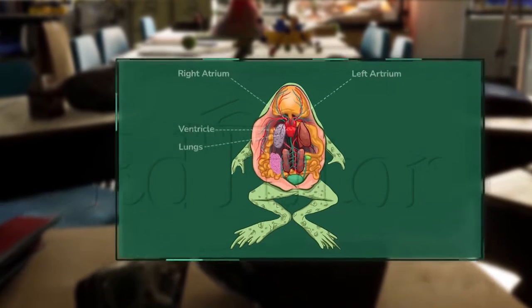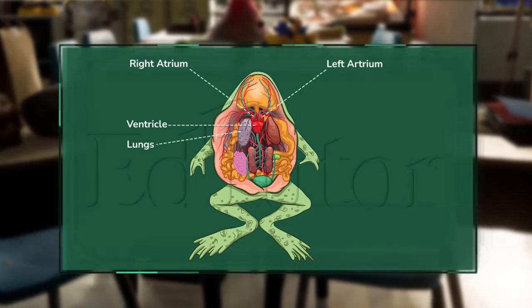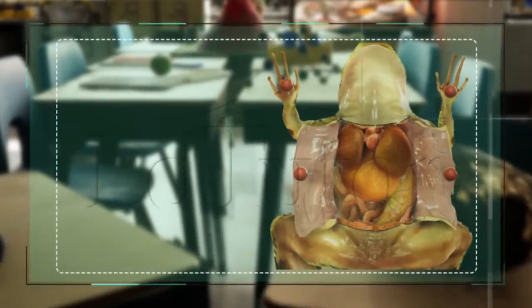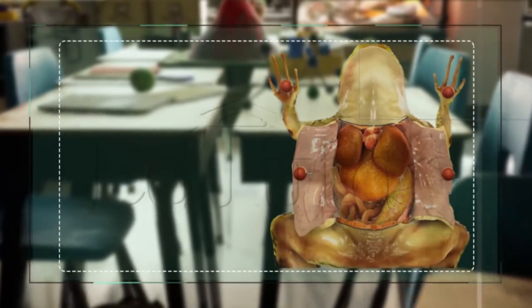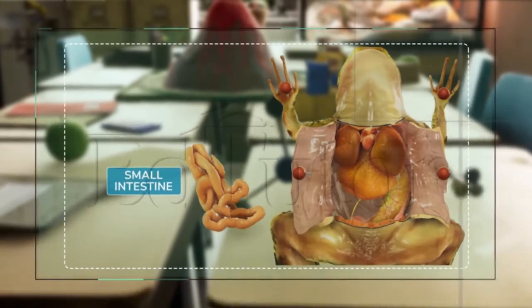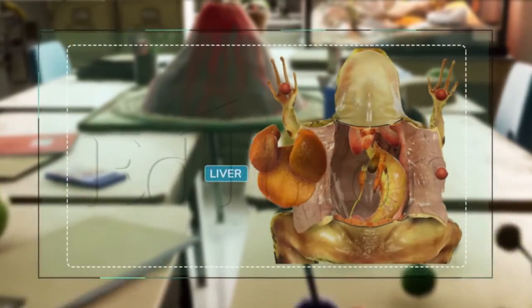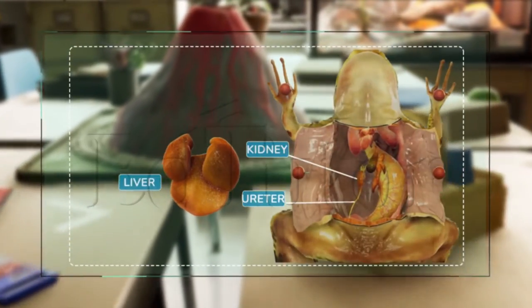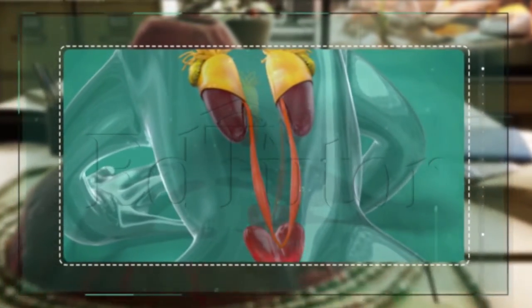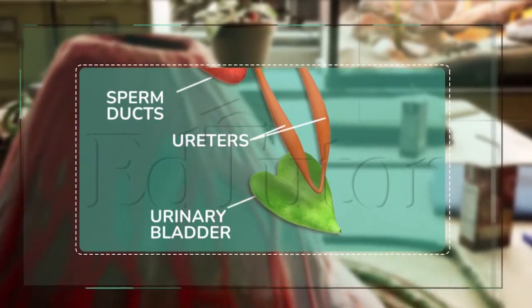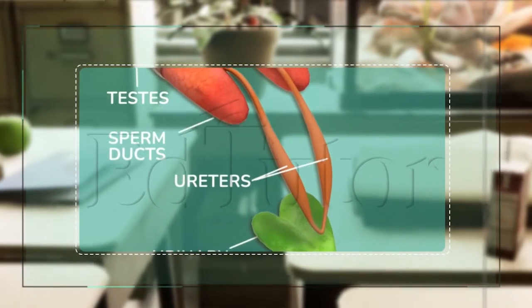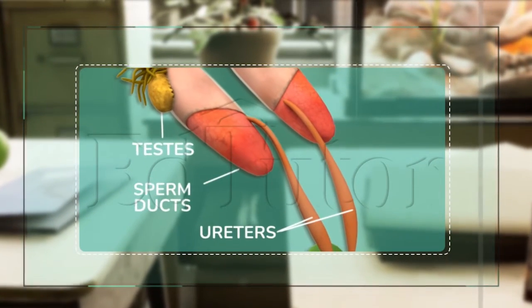As you can see, these are the parts we asked you to identify. Now, using a probe very gently, I am going to remove the intestines and the liver to identify the different urinary and reproductive organs. We can see ureter, urinary bladder, testes, and sperm ducts in case of a male.